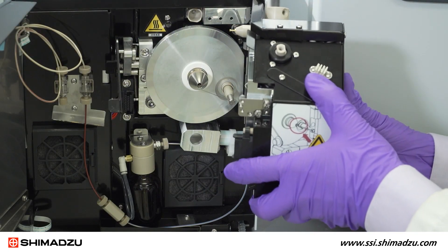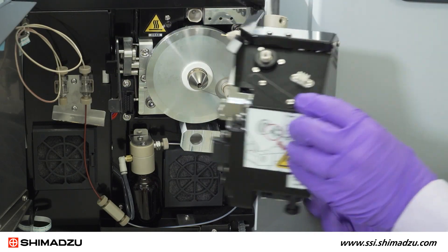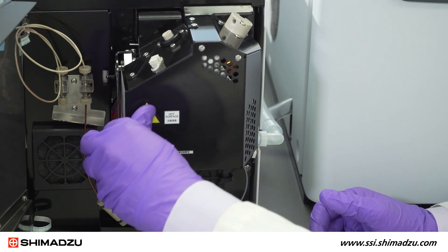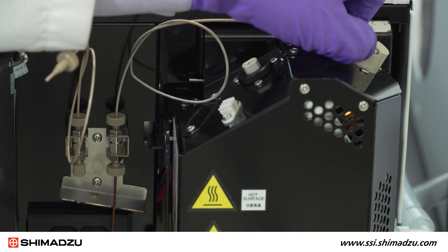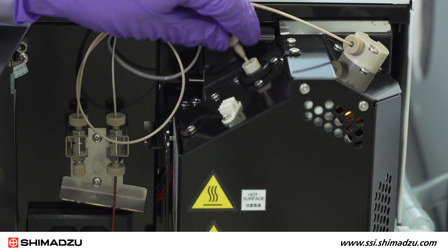Fasten the two covers back in place. Reattach the ionization unit and lock it in place. Reconnect the LC tubing and initiate the heaters, voltages, and gas flows.